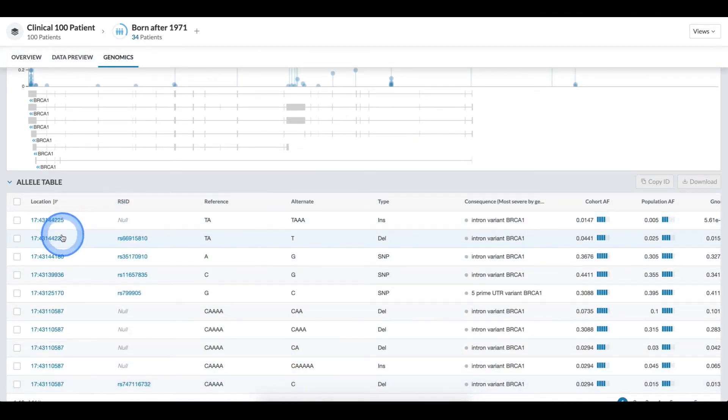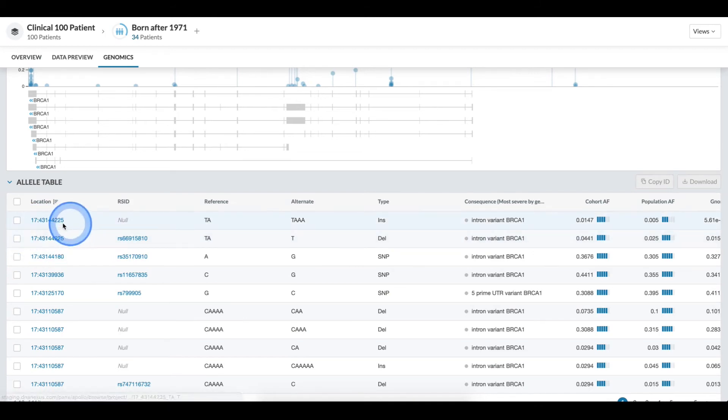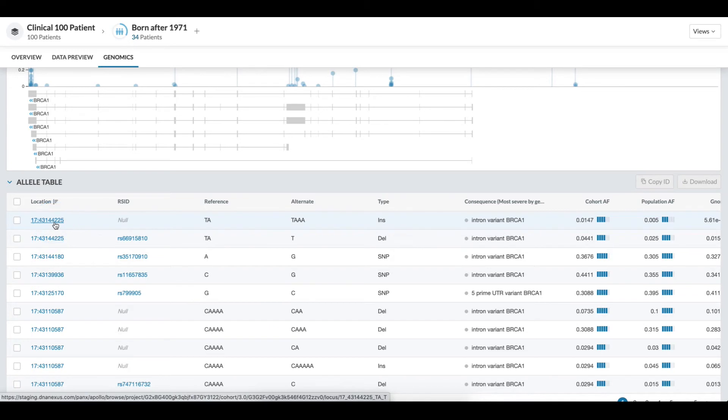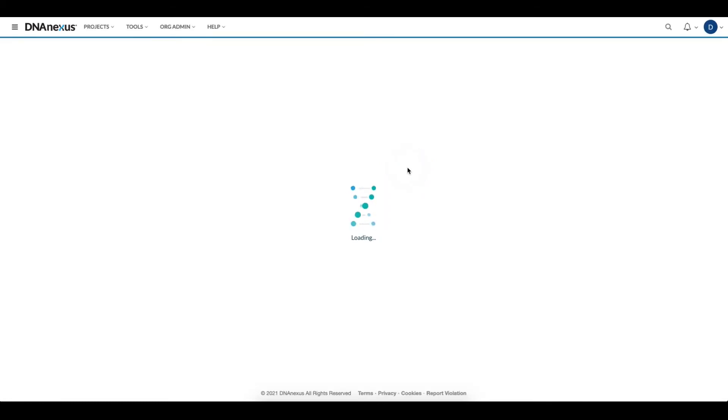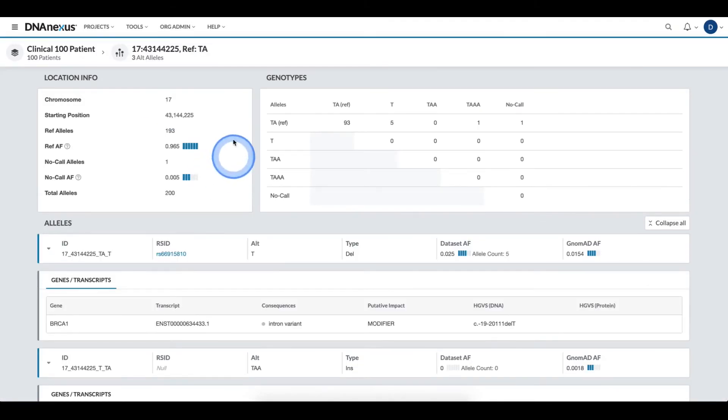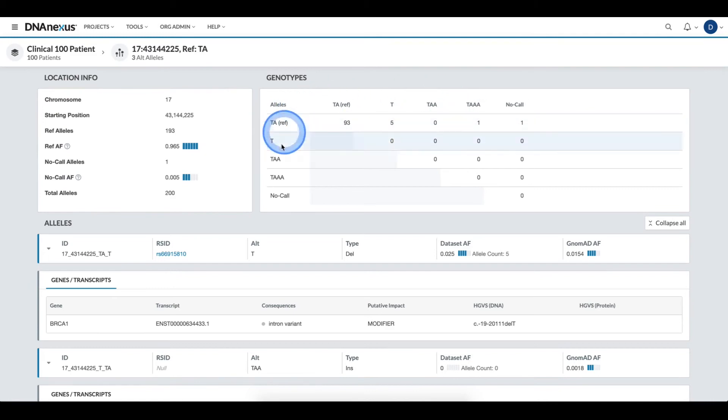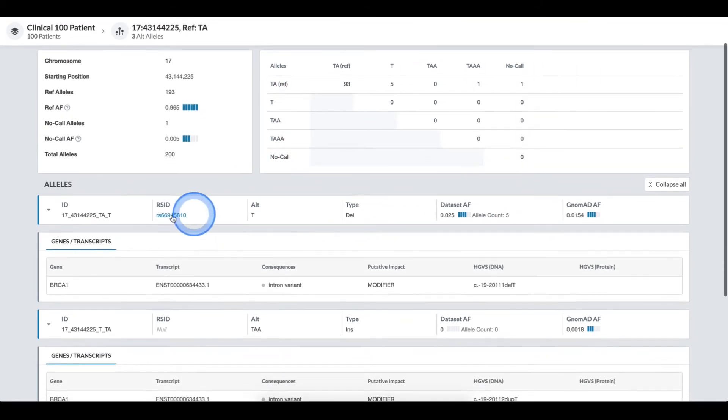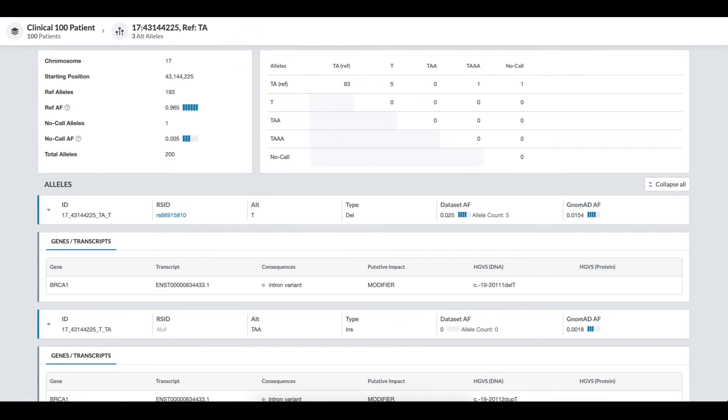If I'm interested in a specific loci and want to get more details on this dataset at that loci, I can click it and I open up the locus details page where I can see location information, the genotype breakdown for the total dataset, and allele specific annotations.